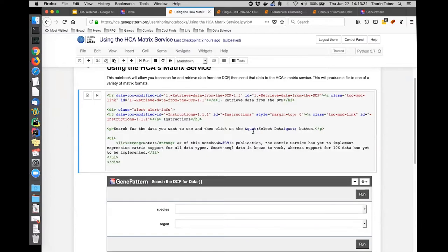If you double-click it, you can see the source of the cell, which can be either HTML or Markdown. One of the goals of the Notebook Workspace is to make it easier to collaborate with researchers of all levels of technical sophistication, from machine learning wizards to bench biologists. One of the features we've added is the ability to edit these cells with a familiar what-you-see-is-what-you-get rich text editor.